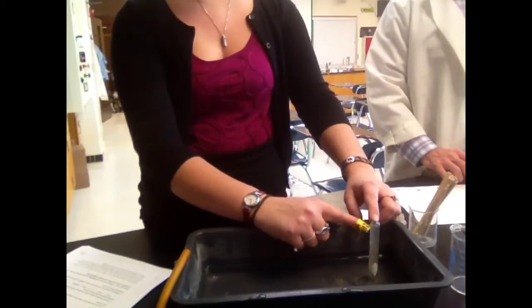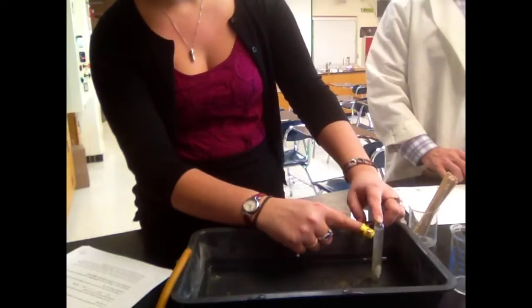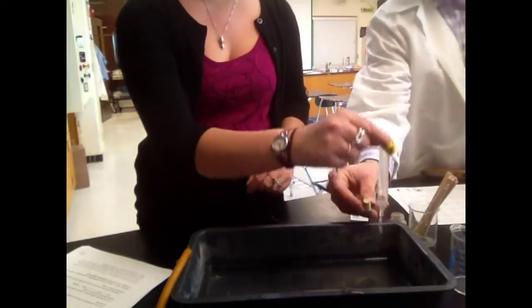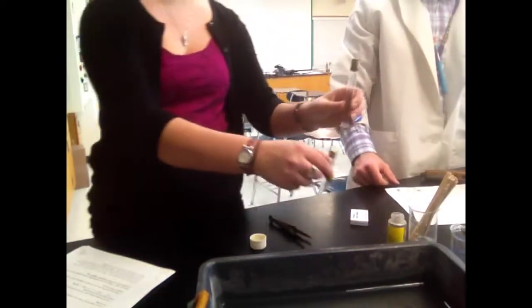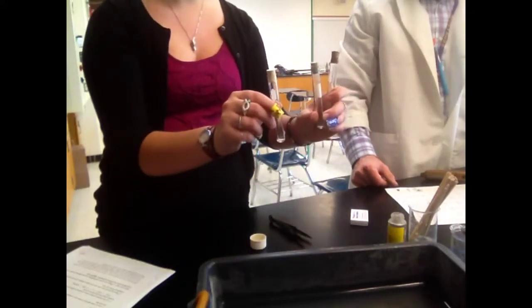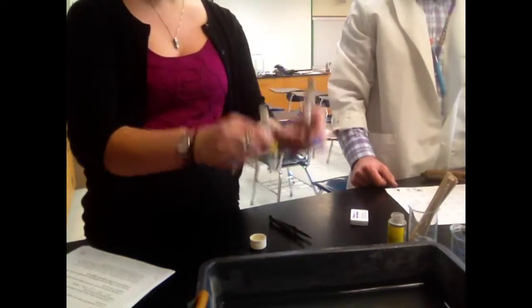After we fill this test tube up, Mr. Scott is going to help me with the second part of this lab. So just a little bit more gas pushing out the water. I'm going to lift the test tube up, let that water out, and then cork it. So now we have our full test tube of acetylene gas. We have our half test tube filled with acetylene gas, and our 1/12 test tube. Now this might sound strange, but we're going to shake up the gas, so that the acetylene gas and the air that's in the test tubes can mix together.